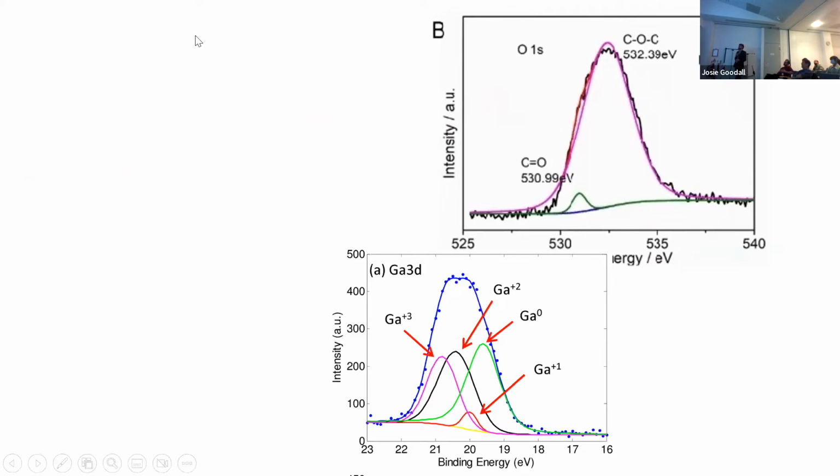You can see what I mean. The top right-hand section there, and likewise the lower one, it's not quite as bad. But three of the peaks have reasonably similar full width half maximum, and one of them, the gallium one, is really, really narrow. So for most photoemission features, this is not physically realistic.